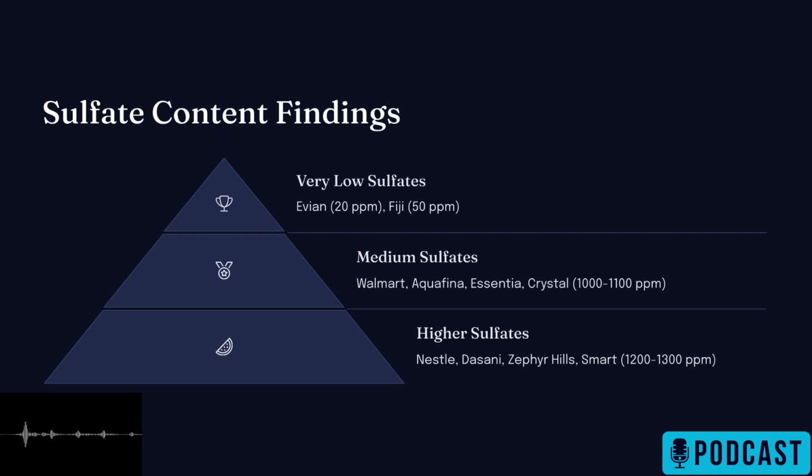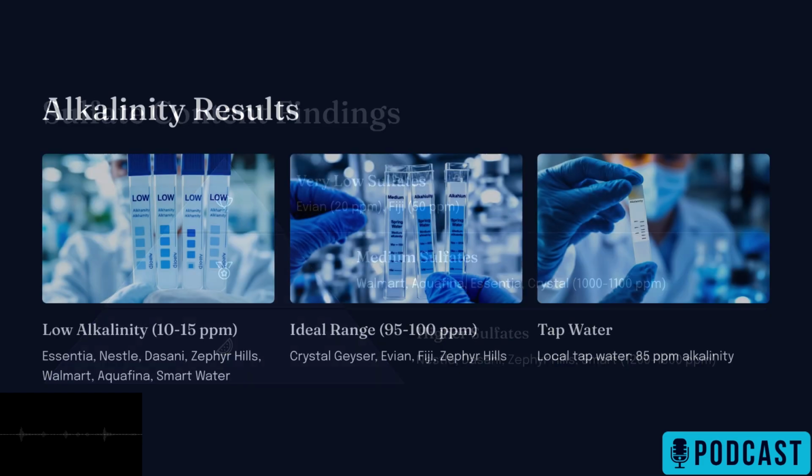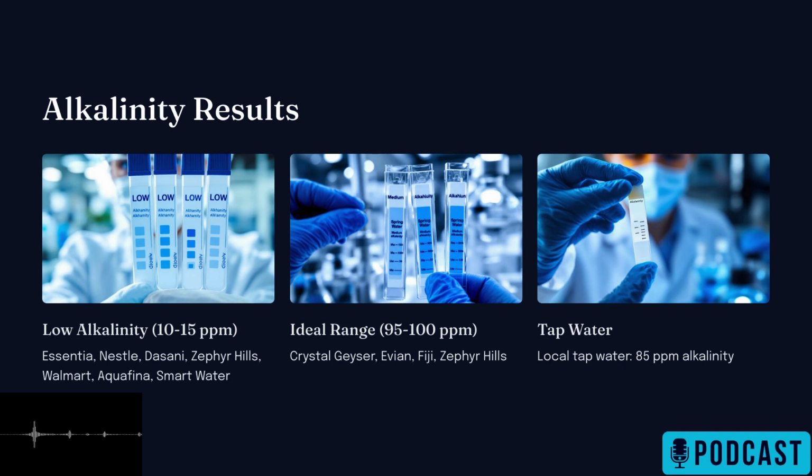So yeah, Evian and Fiji had significantly lower sulfate levels compared to the majority of the other brands tested. That's a really key takeaway if you're watching sulfate consumption. Definitely good to know for people tracking that. What about sodium chloride? You know, plain old salt. Any surprises there? But what's interesting is that across the board, all 10 brands had very low sodium chloride levels, mostly in the 0 to 20 ppm range.